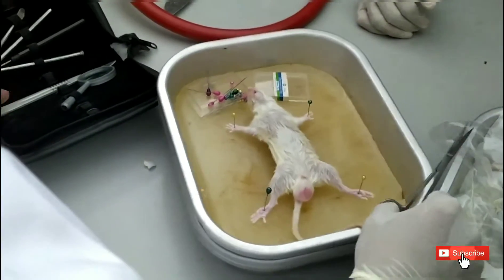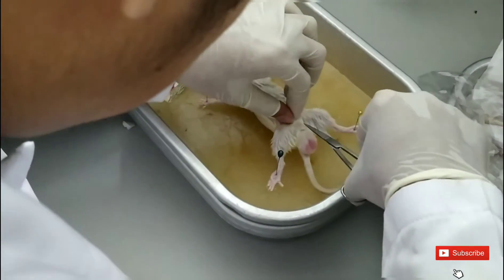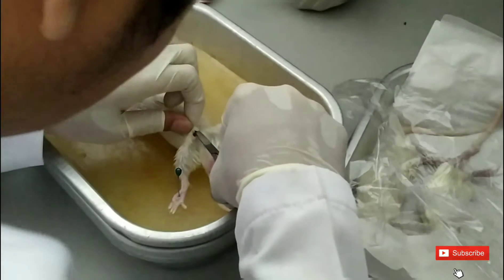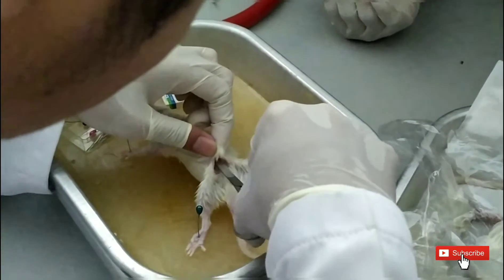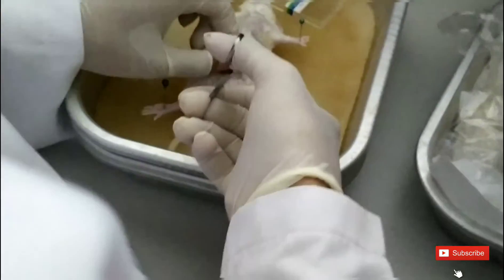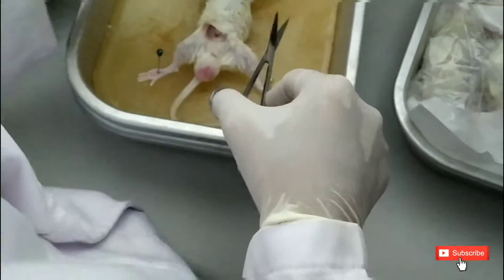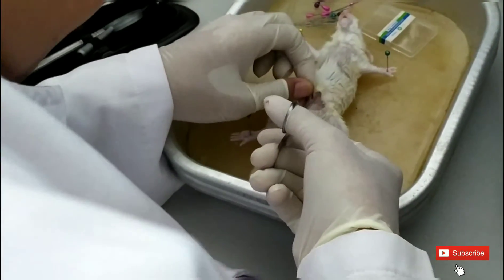We take the scissors and try to cut from the skin, slowly. We have to cut carefully because if we're not careful we will hurt the organ inside. We could damage the organ, and if we hurt it, some liquid from the organ will spread out. So we have to be careful.